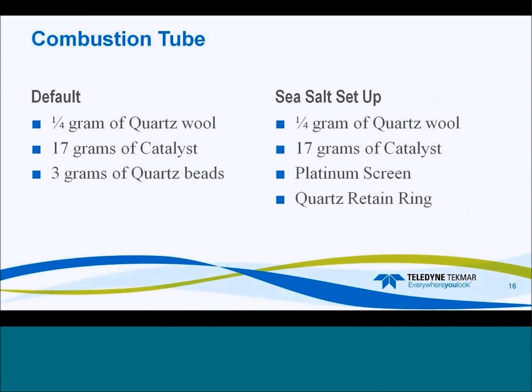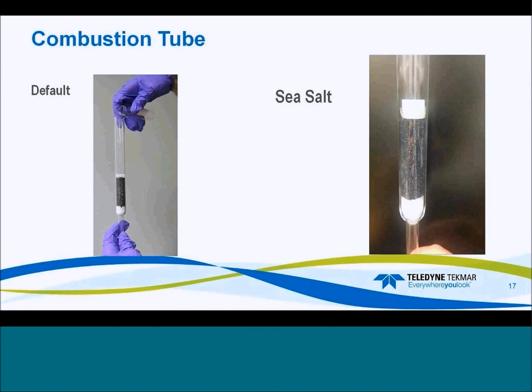So just to go over it again, because I know this is something that is important, they're both the same amount of catalyst. It's just instead of the quartz beads, you're having the platinum screen and the quartz retain ring. And there is another picture. The one on the right is for sea salt, and the one on the left is for the default.